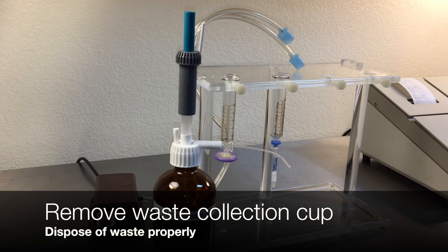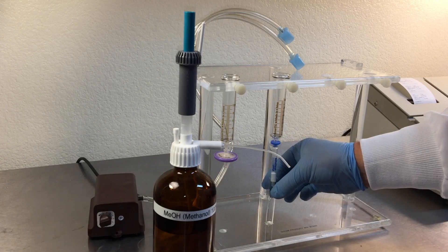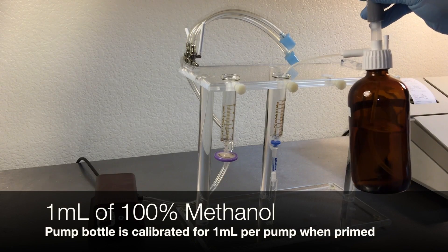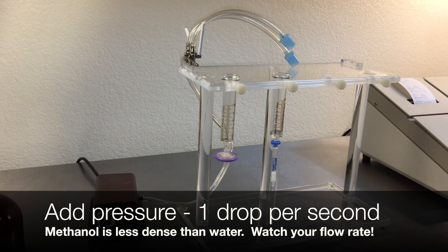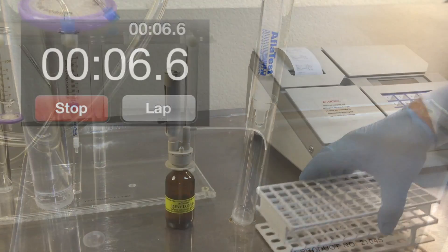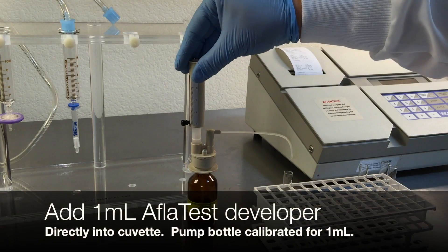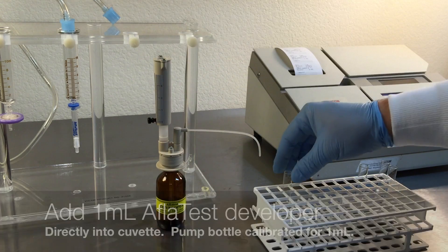Remove the waste collection cup and place a glass cuvette under the column. Note that cuvettes are not reusable — dispose of them properly after the test is complete. Add 1 milliliter of HPLC grade methanol into the syringe barrel. Elute the column at a rate of one drop per second or slower, passing the methanol through the column and collecting all the sample into the glass cuvette. After air has passed through the column, remove the cuvette. Add 1 milliliter of Aflatest Developer solution directly to the cuvette and mix by swirling.